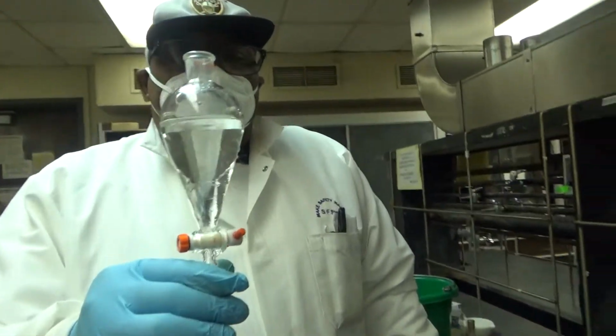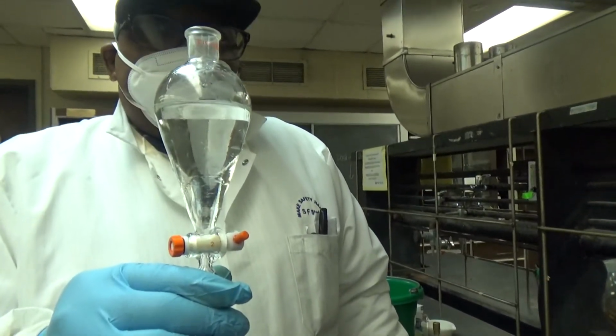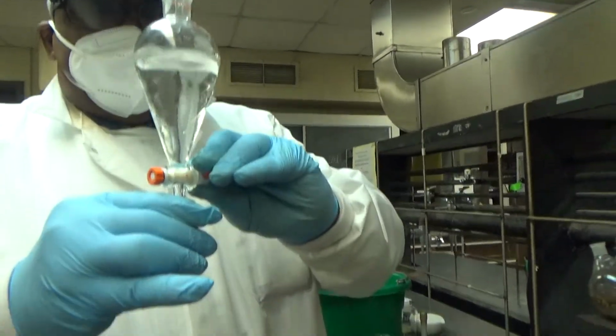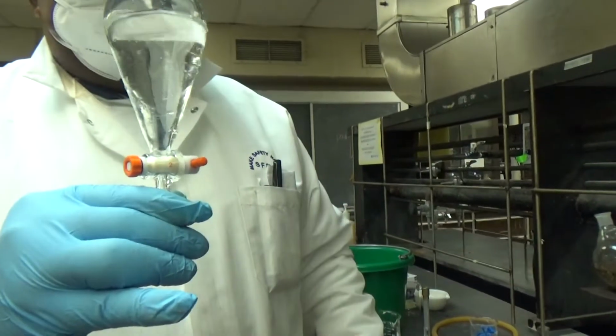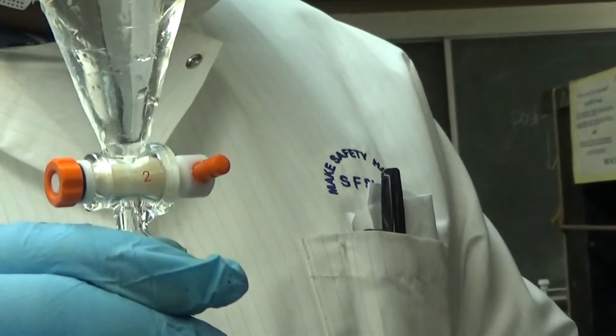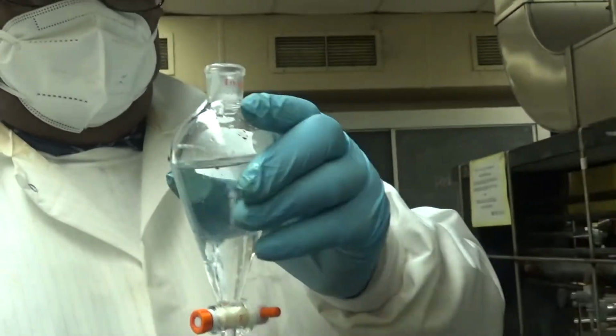All right. So you added roughly three-quarters full of water. You didn't measure that. No, just poured it in. And it's closed. If it wasn't closed, that would be a mess. You close the valve, put some water in there.